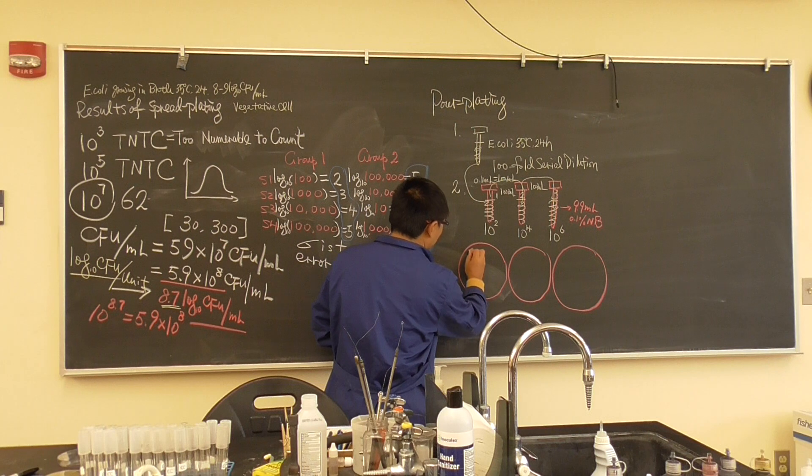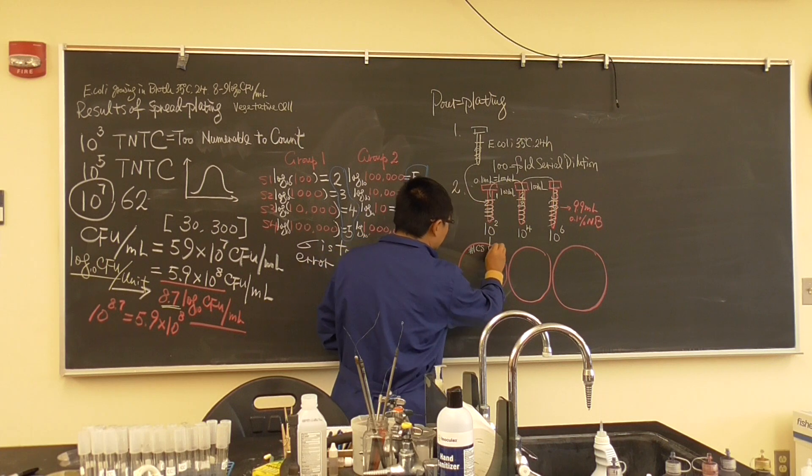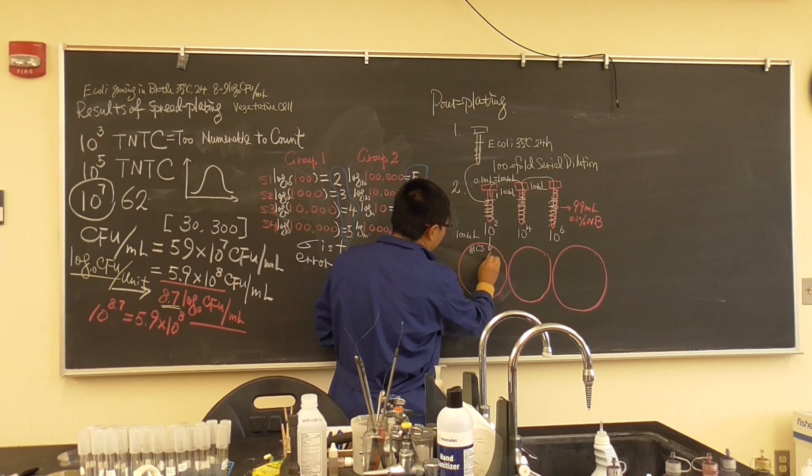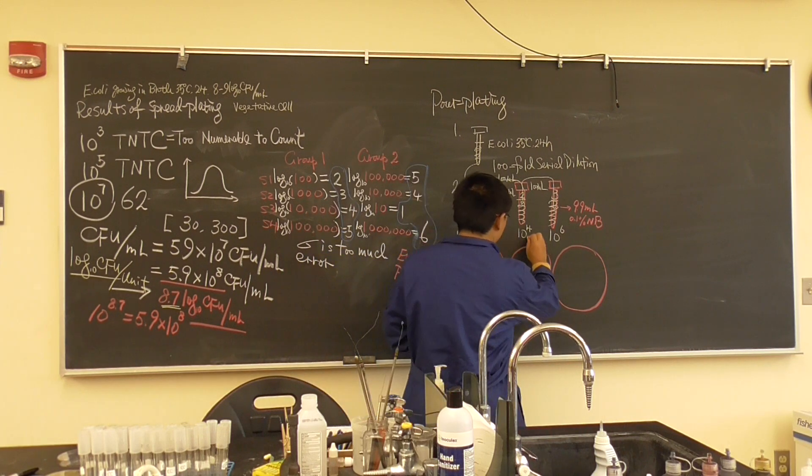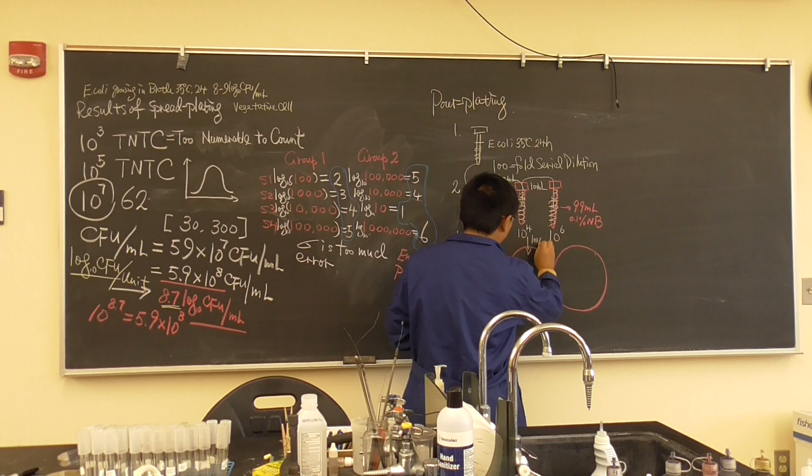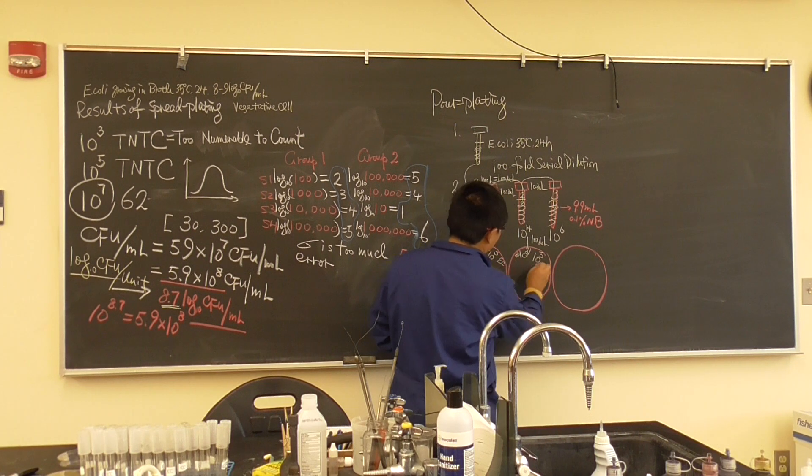So what you're going to label? Bench number, name, final dilution factor. We are adding 100 microliters, so 10 times more than the tube dilution. Same thing goes here, 100 microliters. So you name, bench number, and dilution factor. This is 10 to the 5. Of course, you can write EC there, E. coli.